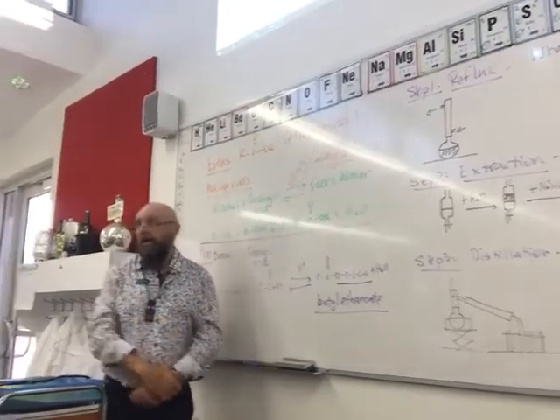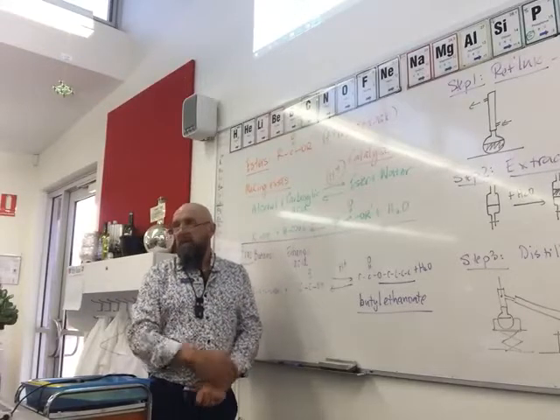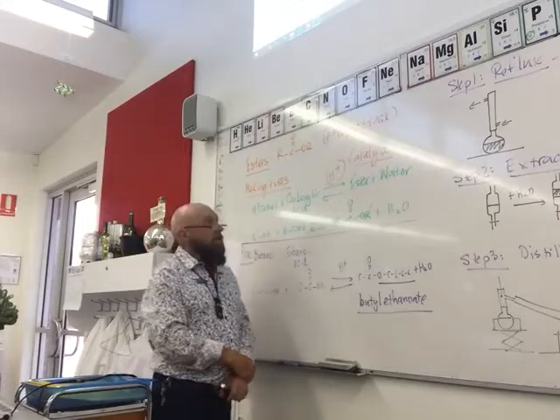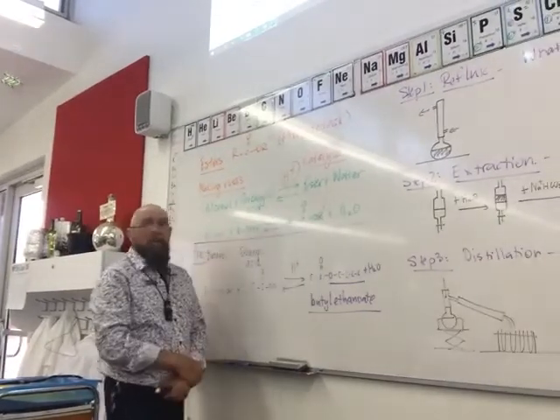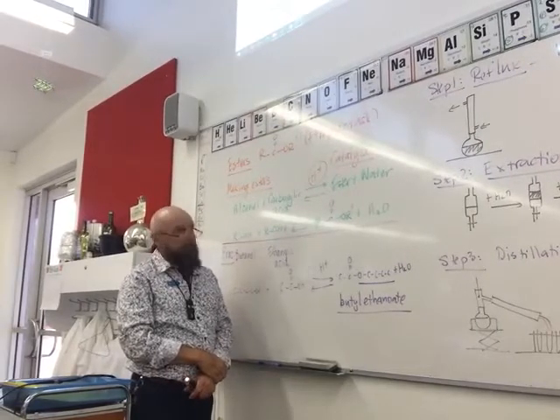Tell me what a catalyst is. What is a catalyst, Rocco? Speeds up the reaction. Good. Year 8, Year 9, science. Speeds up the reaction. So the catalyst, and you notice in the forward direction, is acid. Concentrated acid. That's the first thing you need to take note of.